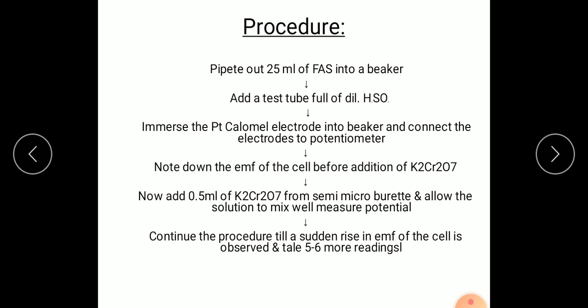Next immerse the platinum-calomel electrode. Platinum electrode and calomel electrode will be taken. One is indicator electrode which indicates the change in concentration and calomel electrode acts as reference electrode. These are immersed into the beaker and connected to the potentiometer. Note down the EMF of the cell before addition of K2Cr2O7. Without adding any drop of K2Cr2O7, take the first EMF reading. Then add 0.5 ml of K2Cr2O7 from semi-microburette, allow the solution to mix well and measure the potential.